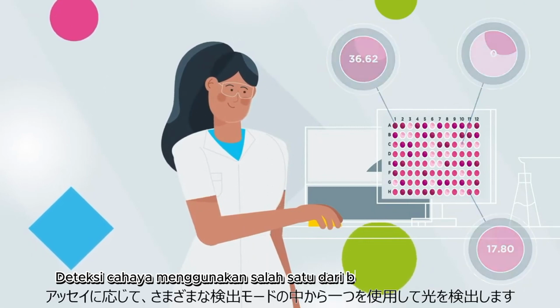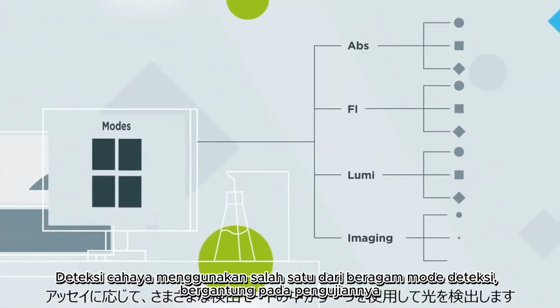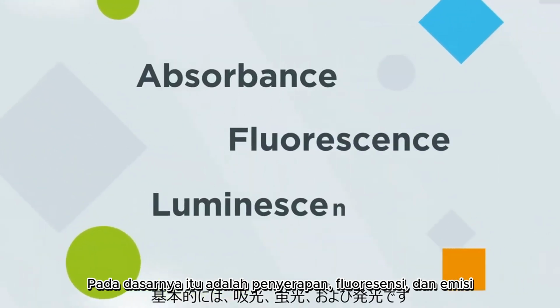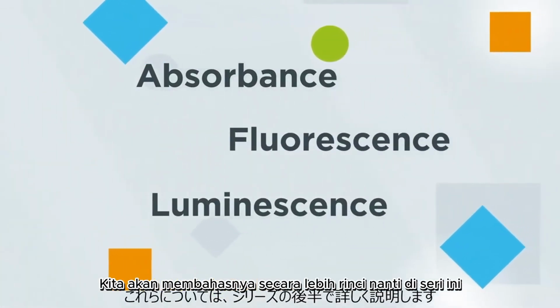The light can be detected using one of many light detection modes, depending on the requirements of the assay used. The most popular modes are absorbance, fluorescence, and luminescence, and we will explain each in detail in further episodes of our series.